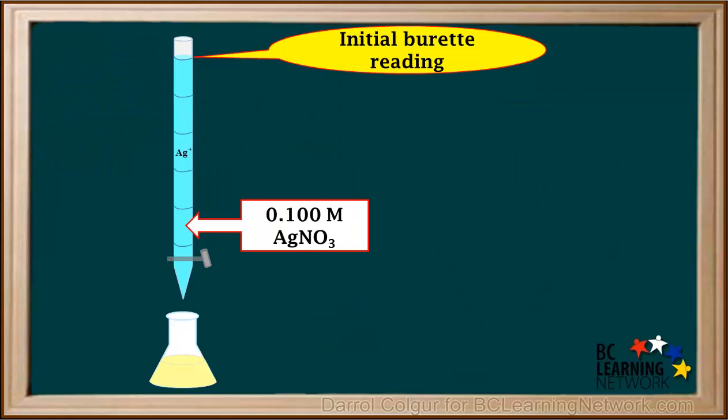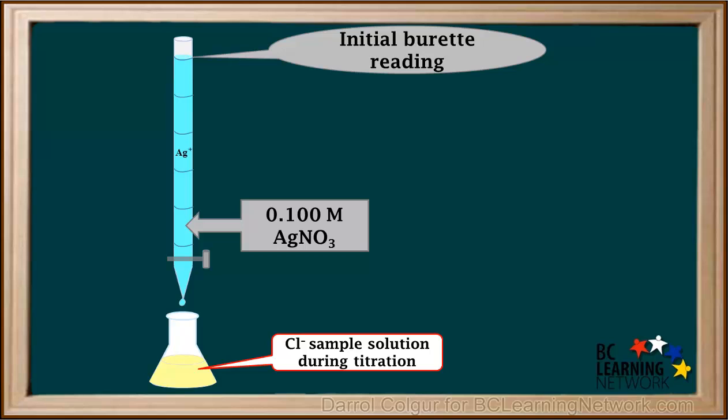We record the initial reading of the AgNO3 solution in the burette, just before we start the titration. Then we begin the titration, adding drops very slowly while swirling the flask.